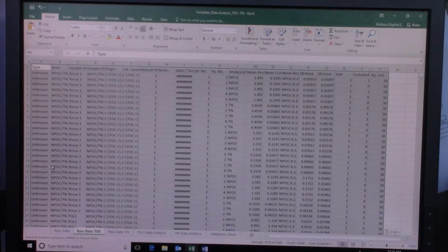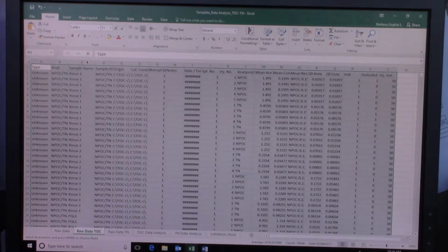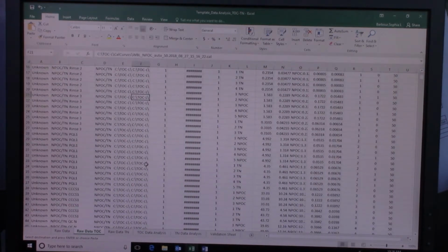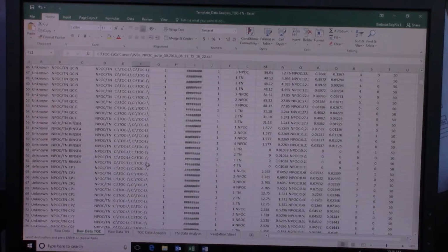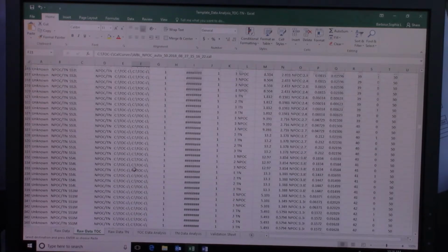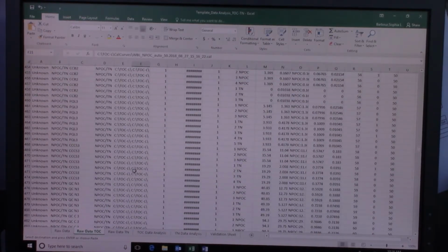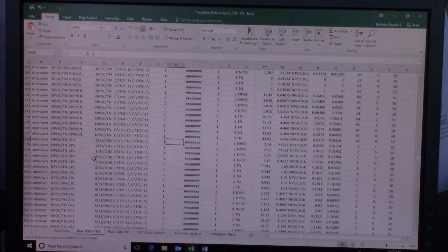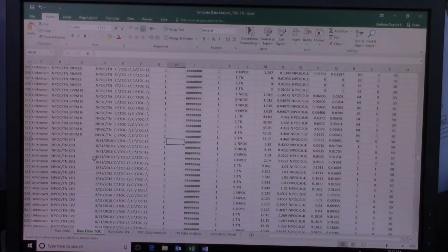Okay, so then all of the sample names should have a unique identifier. Your specific data here, Connor, since we were doing two sets, there is a duplicate sample name starting here that we discussed. Those do need to be renamed, so if I just add an _2, would that make sense to you? Is there a way you could merge the cells together? Would you prefer that? Yeah.